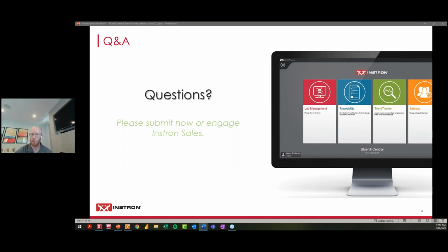That actually has been a common request though, and it is on our feature backlog for Bluehill Universal, our testing software, to have reference curves. So it is good to know that more and more people are asking for that capability. That helps us know what we want to put into the product down the road. So thank you for that.